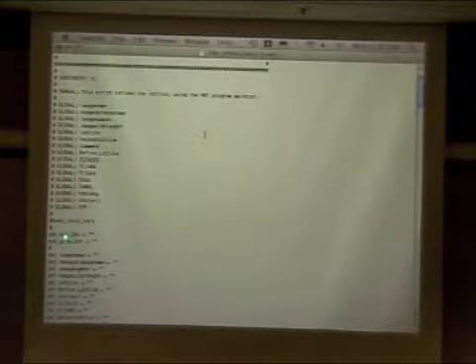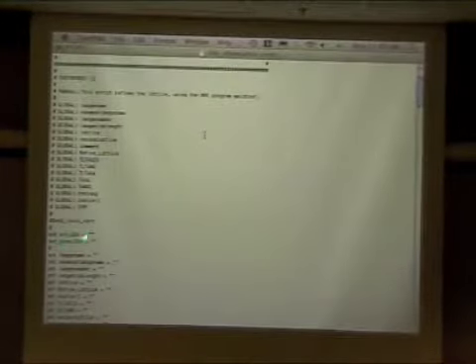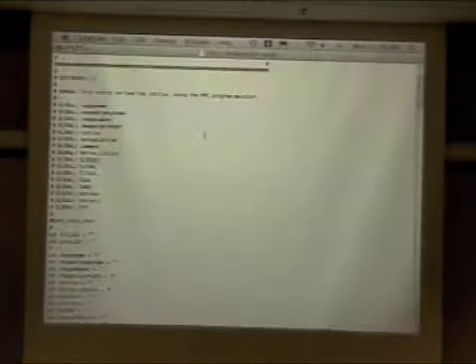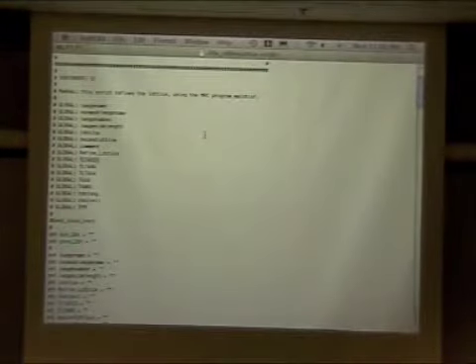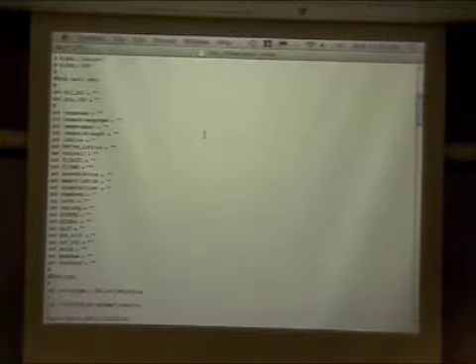And then we've got two specially defined directories. One's bin_2dx, one's proc_2dx. Those will get populated when you run, just using this play button, with the bin directory, where our 2DX MRC programs are, and the proc directory, where we keep a number of useful scripts for output and display. So that way you can just do a $bin_2dx/whatever your name of your program is and get right to it. All of these other variables are the ones that are available to the script.